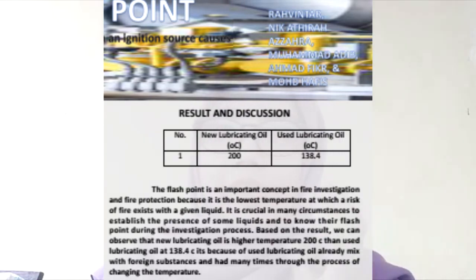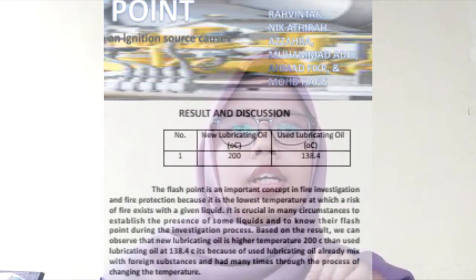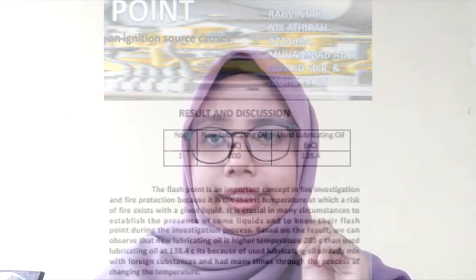The factors affecting the flash point are frequency of application of test flame, rate of heating, rate of stirring, size of test, and time of opening the shutter.